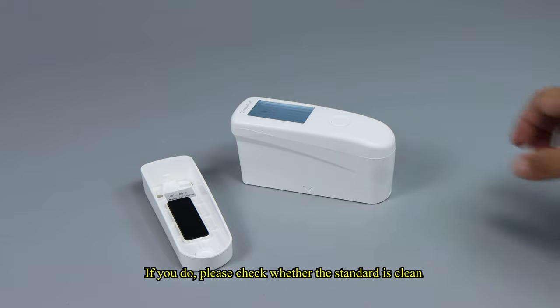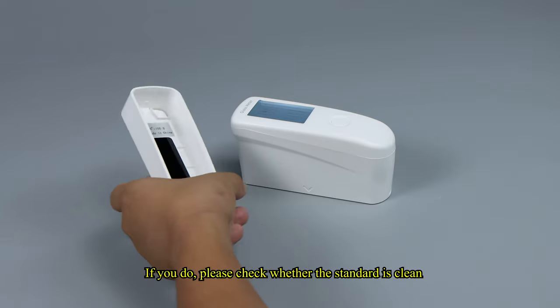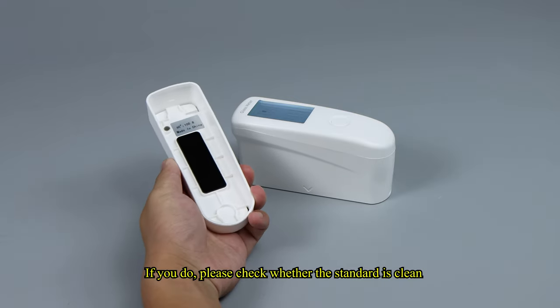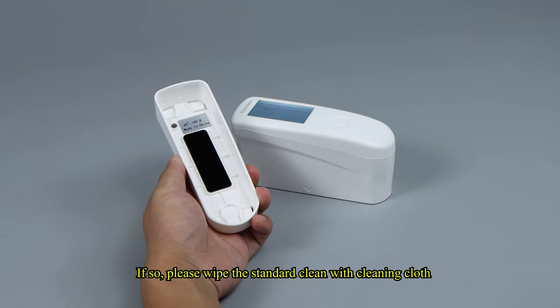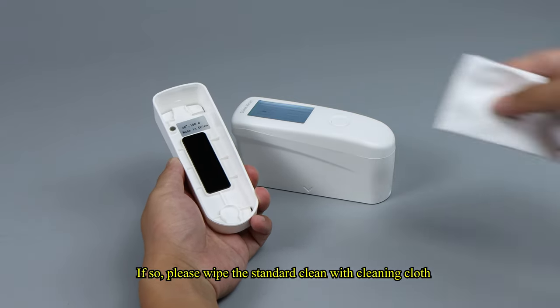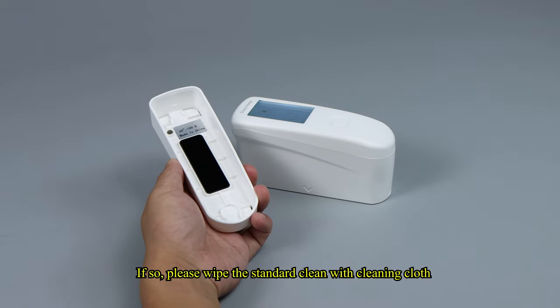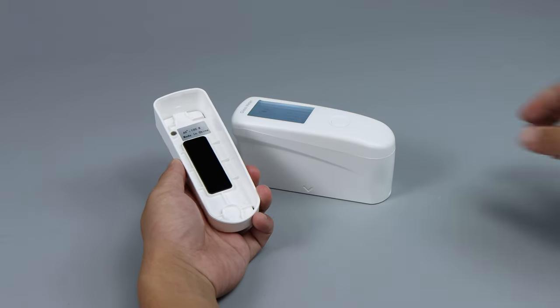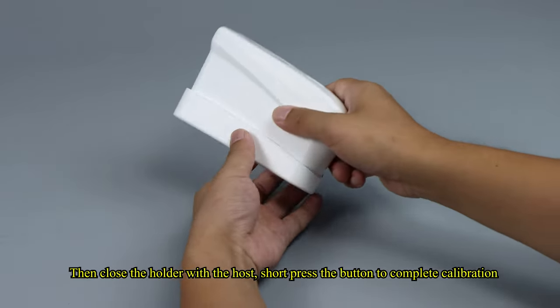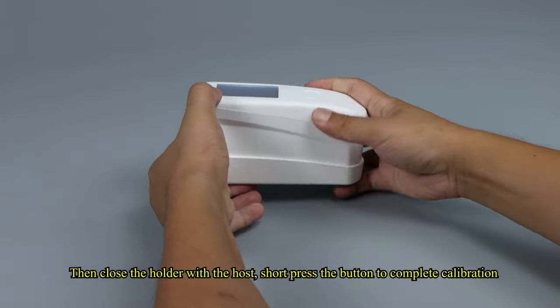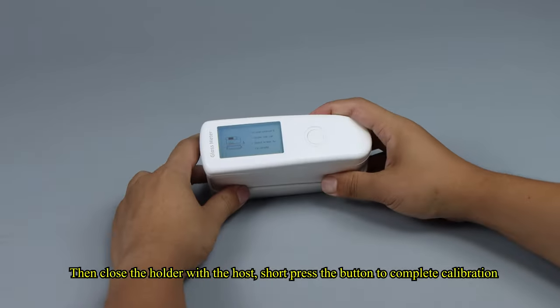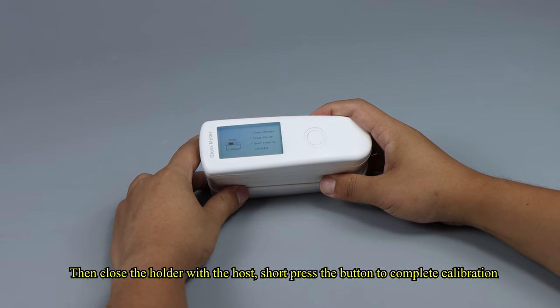If you do, please check whether the standard is clean. If so, please wipe the standard clean with cleaning cloth. Then close the holder with the host, short-press the button to complete calibration.